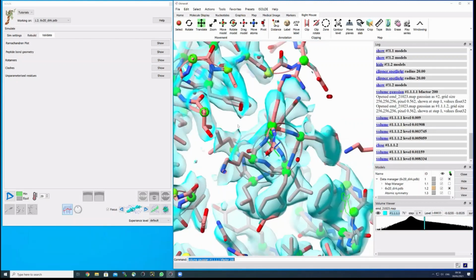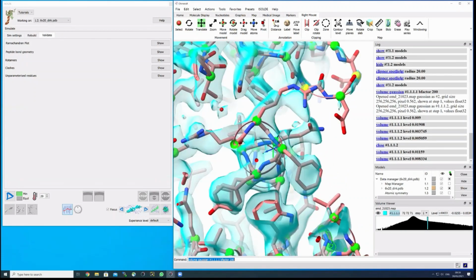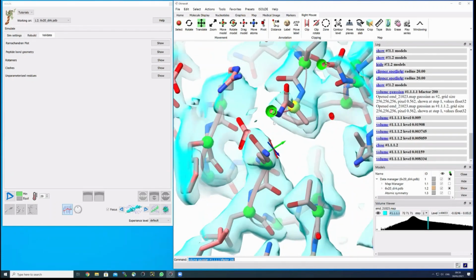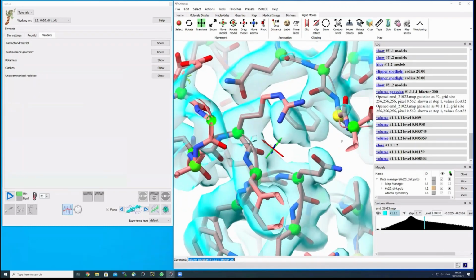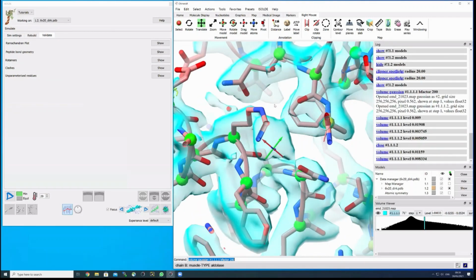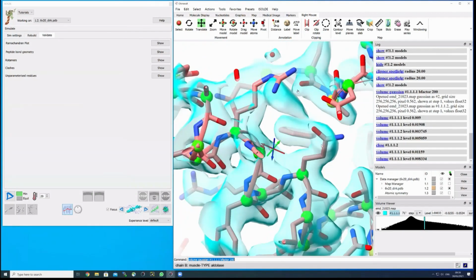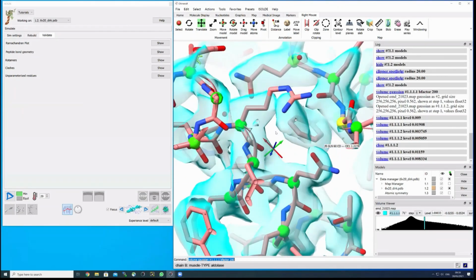So, as I just noticed here, for example, and this is another observation, you can clearly see that this arginine sidechain is not where it is supposed to be sitting. It's outside of its density, while it's not flagged by any of the metrics that are used here currently, because the backbone geometry is okay and also the sidechain is a favored rotamer. So it's not flagged, but it's still not correct because it's outside of its density. And if I investigate the environment, I think it should probably make a contact with this glutamine residue and eventually also with the backbone here.